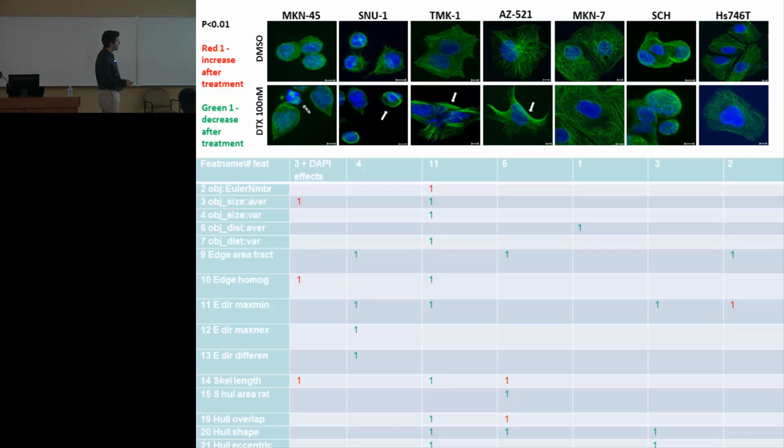So far what I thought was that if we have certain edges with a uniform angle, that would mean they're affected by treatment, because there is a reorganization of all the proteins. Instead of spread proteins like that, they all become aligned in one direction.